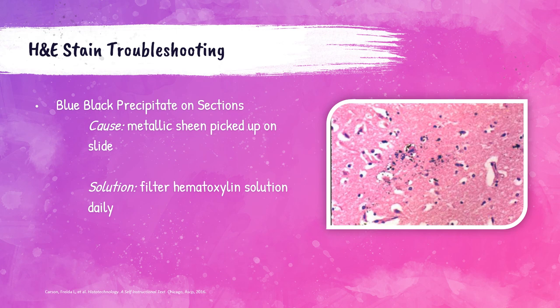Sometimes a blue-black precipitate can be found on the section — visible in this photo of brain tissue. This is caused by the metallic sheen precipitate that forms in many hematoxylin solutions being picked up and deposited onto the slide. This can be prevented by filtering the hematoxylin solution daily.